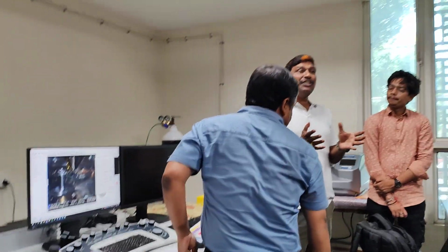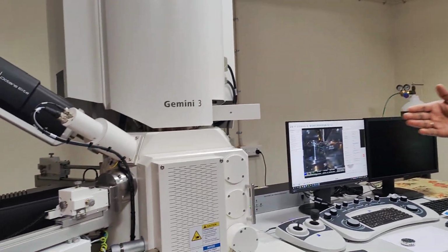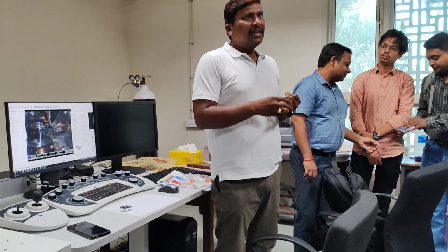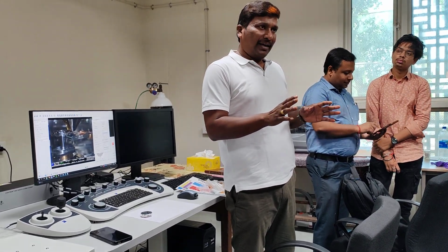We don't image liquids, but here is how to handle liquid samples. If you have nanoparticles dispersed in a liquid, then drop cast and dry the sample. That is good enough to handle the sample.